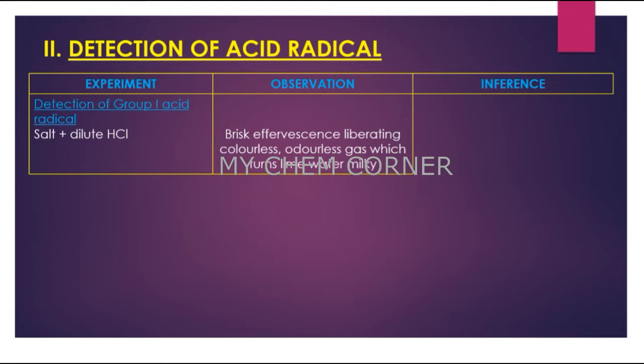When you open a cool drink bottle, you would see a fizz, right? The gas coming out. That is what you're expected to see the minute you add dilute HCl. Now when you have brisk effervescence, obviously it is releasing some gas, a colorless, odorless gas. The minute you add dilute HCl, you need to place a wet test tube inverted over the other test tube. Now what happens is you're trying to collect the gas in it.